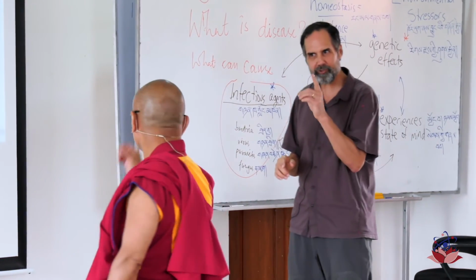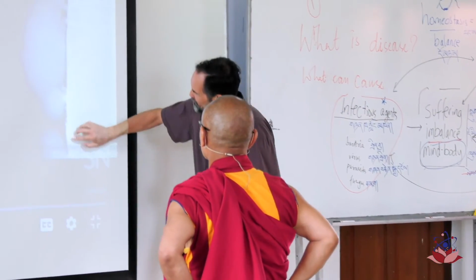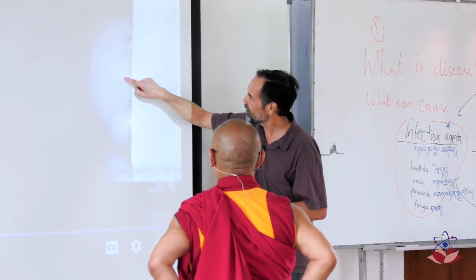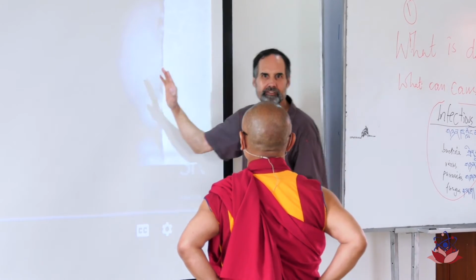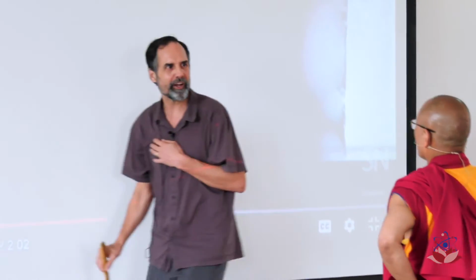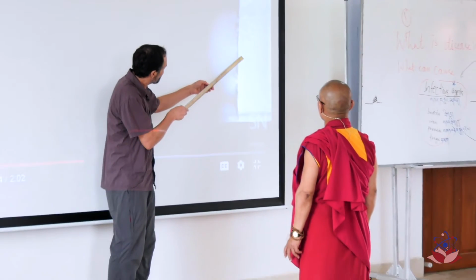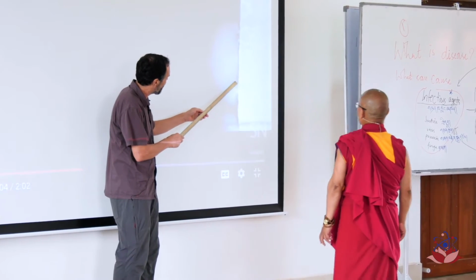Okay, now here's another interesting thing. So this is very rare. There's billions of bacteria here. Very rare that one can grow in the 1x, right? Very rare. Okay, let's look at this side. So this is very unusual to grow, right? There are billions of bacteria along the surface, and one gives rise to this family, and one.